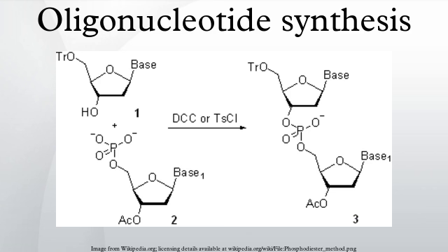In an ES-MS spectrum, a given oligonucleotide generates a set of ions that correspond to different ionization states of the compound. Thus, the oligonucleotide with molecular mass M generates ions with masses (M − nH)/n, where M is the molecular mass of the oligonucleotide in the form of a free acid, n is the ionization state, and H is the atomic mass of hydrogen. Most useful for characterization are the ions with n ranging from 2 to 5.